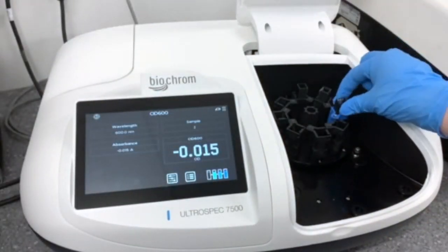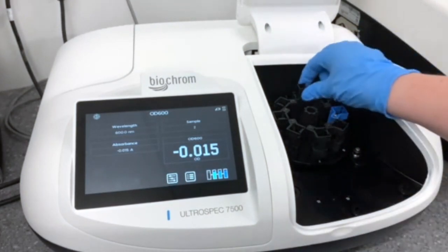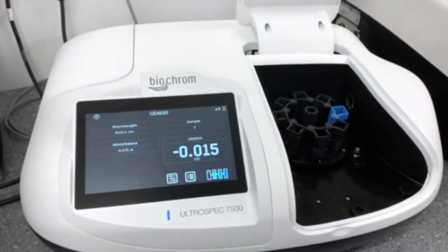Because we had three samples measured, you can see that the blue cell has moved along to the side. You can now take your samples out and you're ready to go.